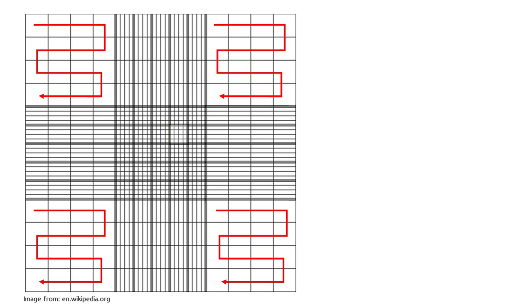It's important you count properly to get an accurate count. Go box by box in a systematic manner through the entire grid; this way you won't miss any of these spaces within the grid.